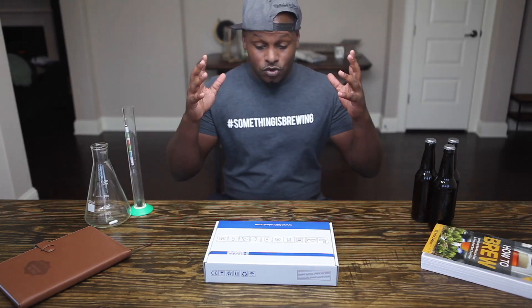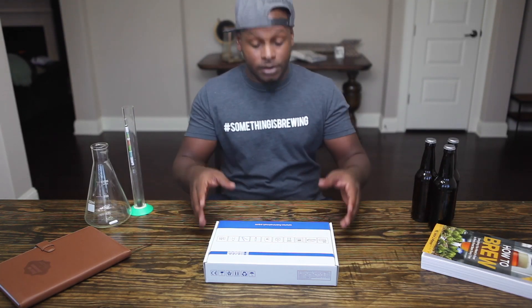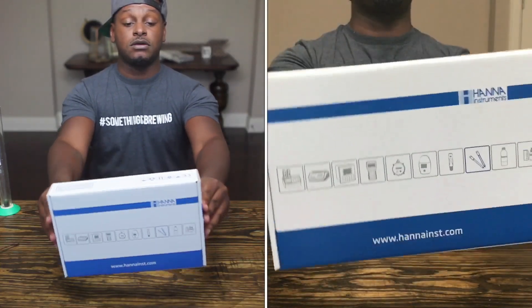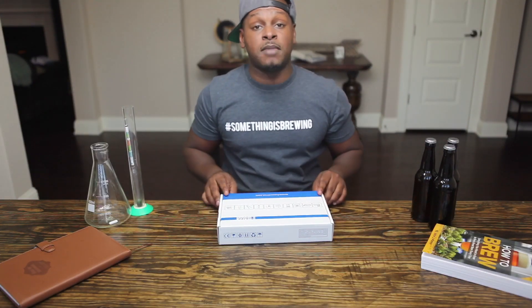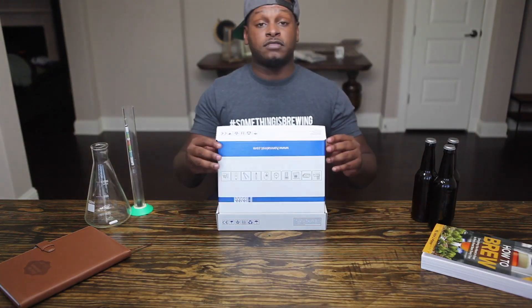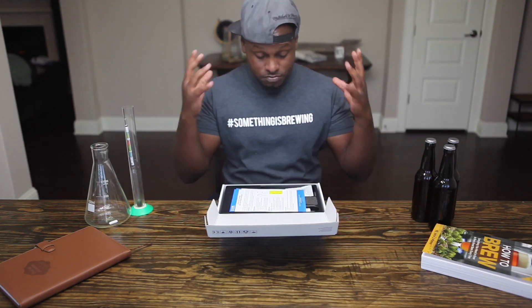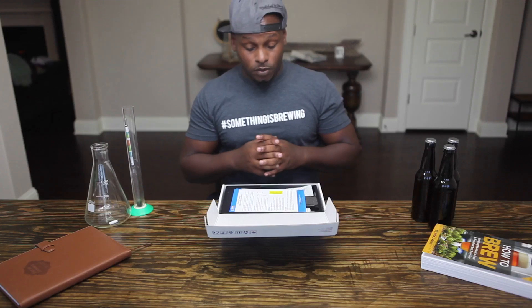I've been chatting with the team over at Hanna Instruments and I have been blessed with the opportunity to test out, sample, and dive in head first with their brand new pH Meter called the Beer Halo. It comes in awesome packaging as you can see here. I got it just before my last couple of brew days and so far I am highly impressed with the construction and the results I've been getting — mind blowing.